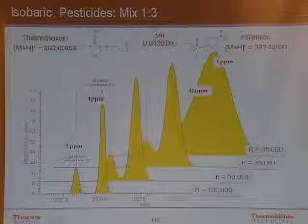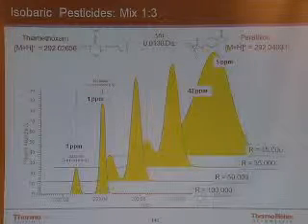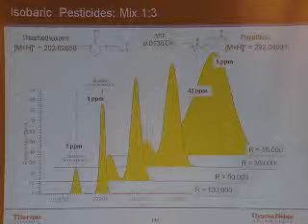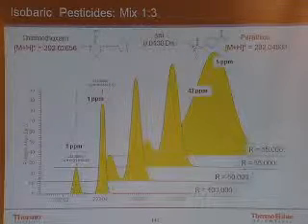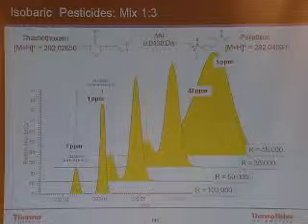Okay, so this is taking a very, very complex situation of 2 identical pesticides in molecular weight, and now mixing them in a 3 to 1 mixture, and being able to determine the molecular weights to a part per million.